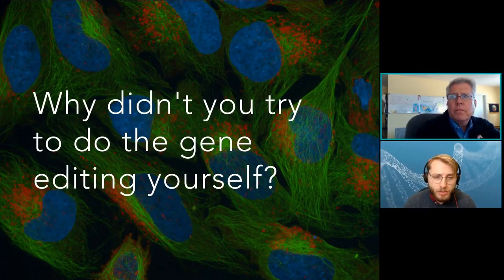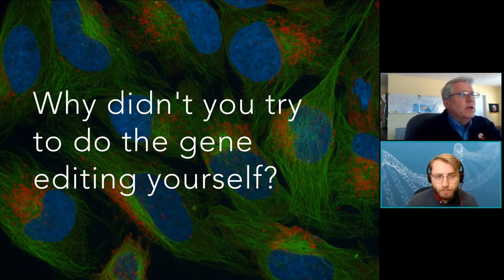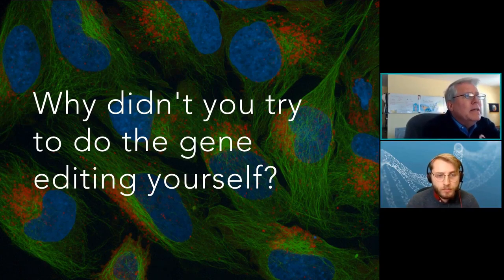So why didn't you try to do the gene editing yourself then? Yeah, great question. Well, it really stems from the fact that my team at that time didn't have the experience or expertise to perform these types of knock-ins. These are very, very difficult types of knock-ins to get to work, and we just didn't have that kind of expertise.